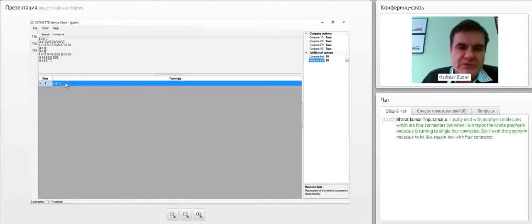And we saw it before. That's true. L means that this is a layered topology. This is 2-dimensional topology. And the number 13 means that this is the 13th topology among these kind of topologies with two nodes of this coordination and layered topologies.